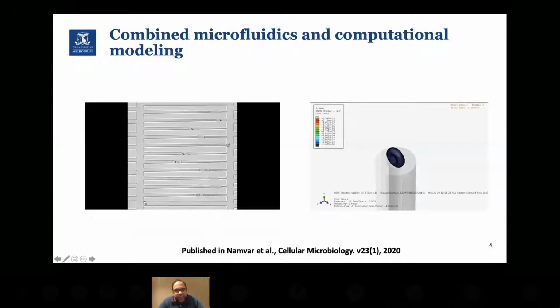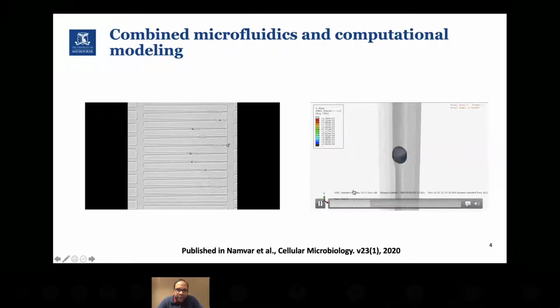So what we did was we developed a microfluidic device where we put these red blood cells through narrow channels that basically had a wedge shape, and they would get stuck wherever they got stuck. That is the furthest they could go, or what we call the minimum equivalent diameter that they could reach by squeezing through the channel. We also then built a computer model which involves parameters for the stiffness of the cell and the shape of the cell, obviously.